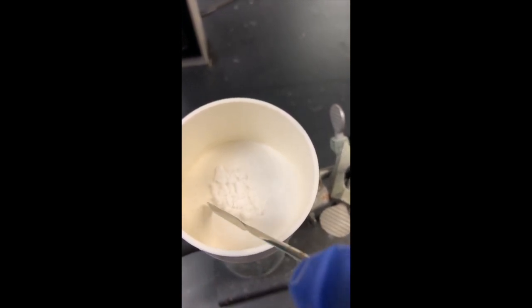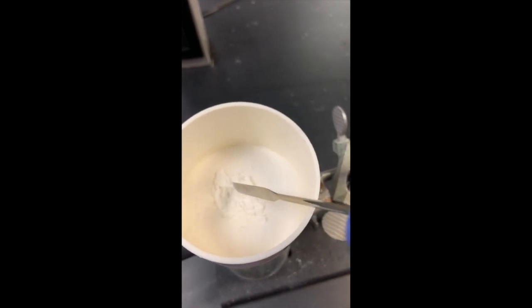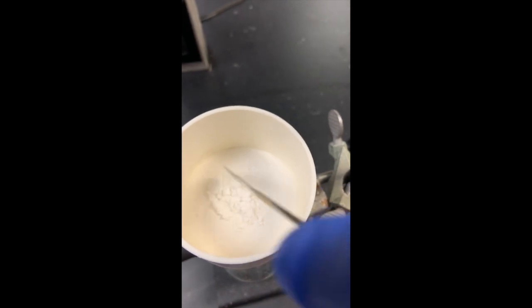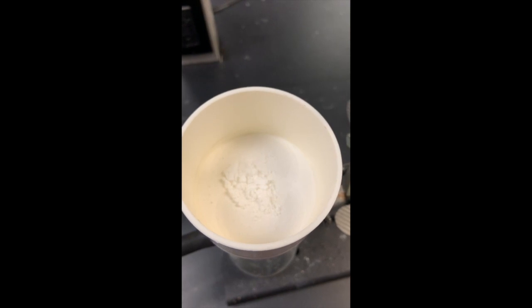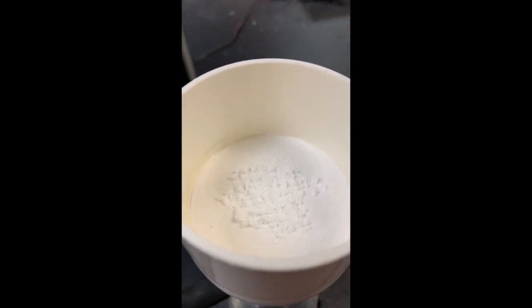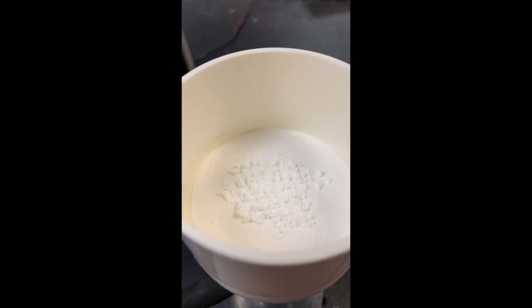So it's been about a minute, I'm going to just gently scrape this. And now I'll wait the remaining 7 minutes for it to dry out. All right, it's been 8 minutes of vacuum filtration, and here is my synthesized aspirin.